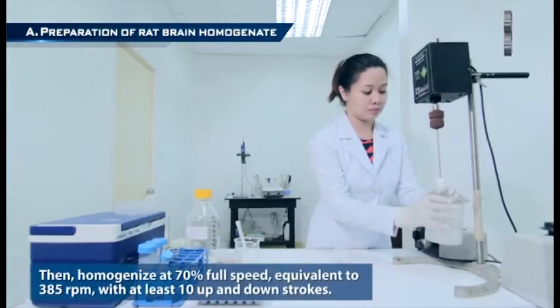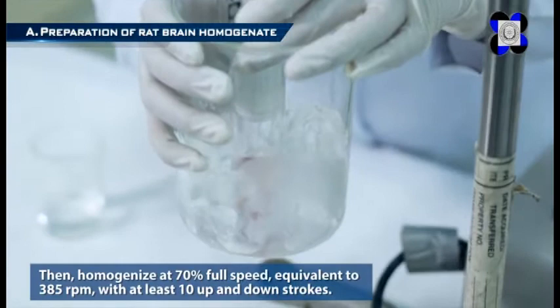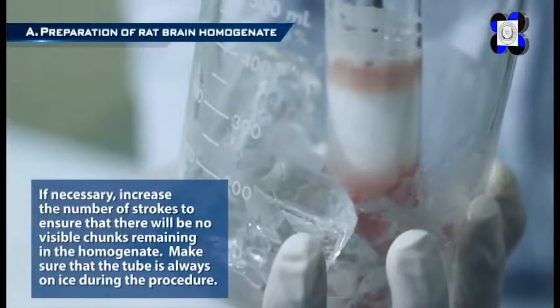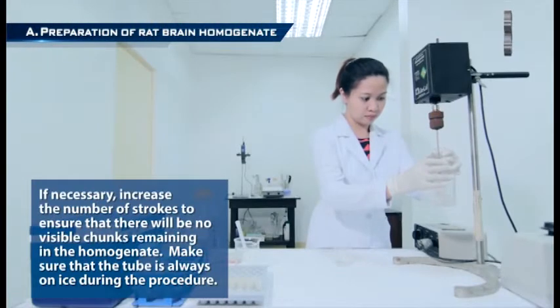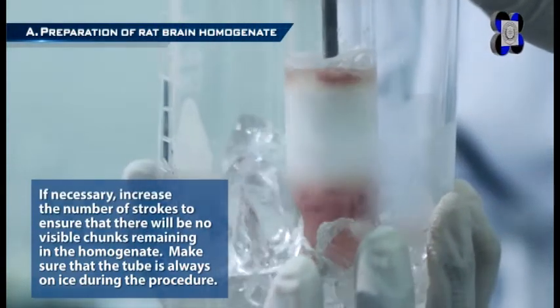Then homogenize at 70% full speed, equivalent to 385 RPM, with at least 10 up and down strokes. If necessary, increase the number of strokes to ensure that there will be no visible chunks remaining in the homogenate. Make sure that the tube is always on ice during the procedure.